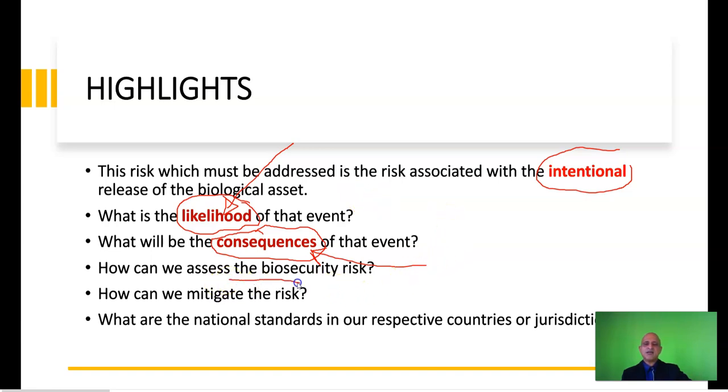So you assess the biosecurity risk and you mitigate the risk, both in terms of this intentional release. And finally, you have national standards and national laws, which you must refer to when you consider biosecurity management.